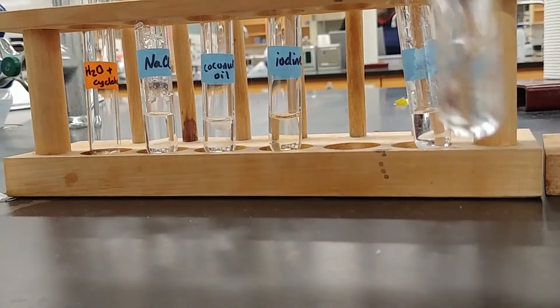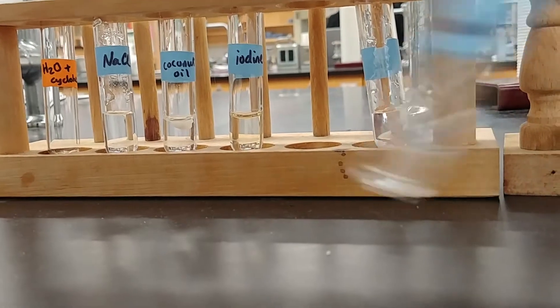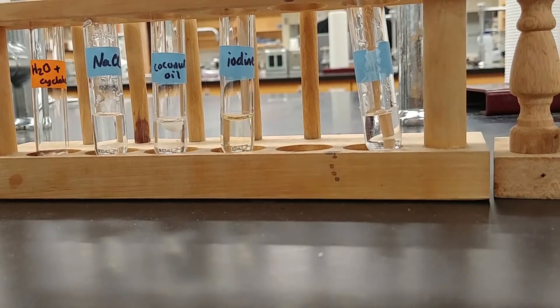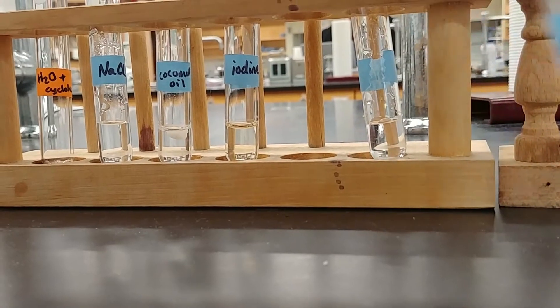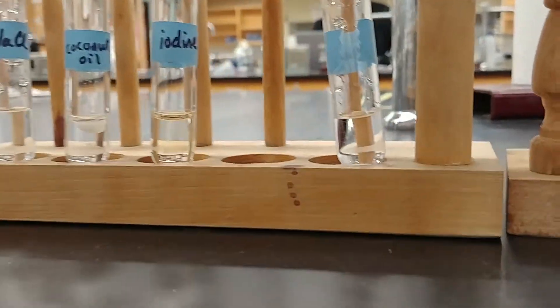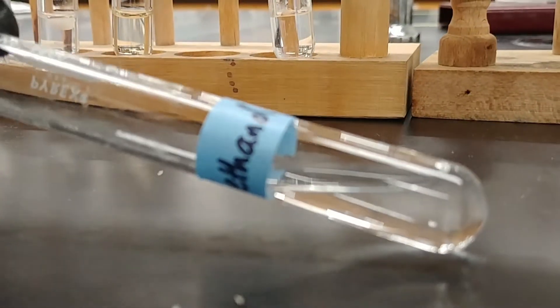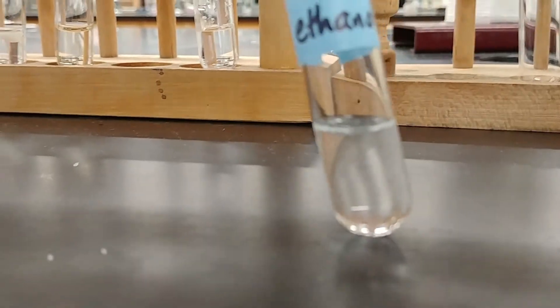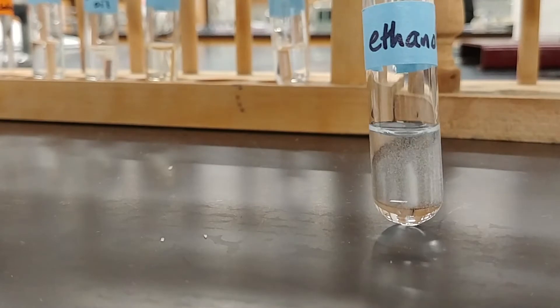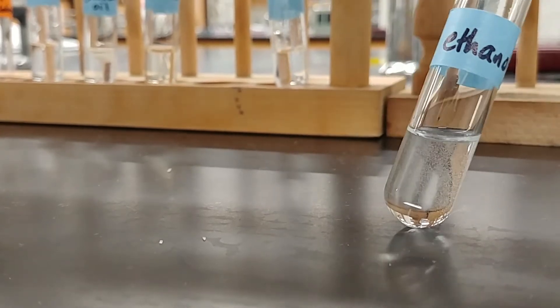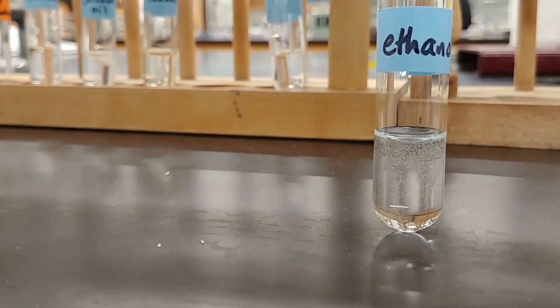And then we have ethanol and water. Now in order to tell whether these are mixed, we are going to look at this liquid very closely to see if it is one single liquid or if it's two separate layers. And so tilting the test tube like this kind of helps us look for any sort of double meniscus and see if we actually have two layers or just a single layer.